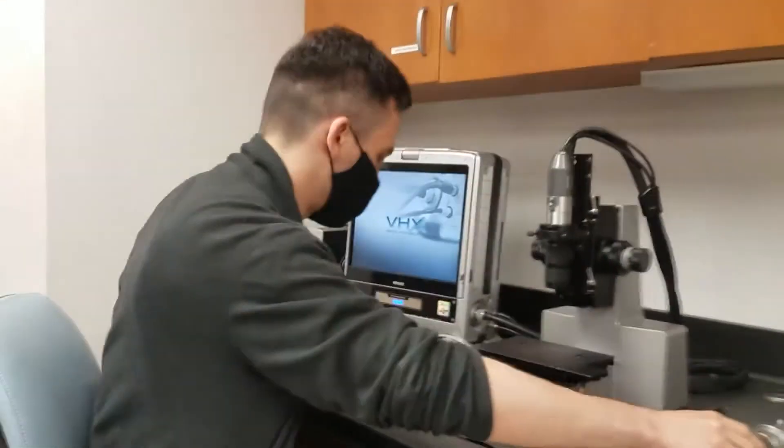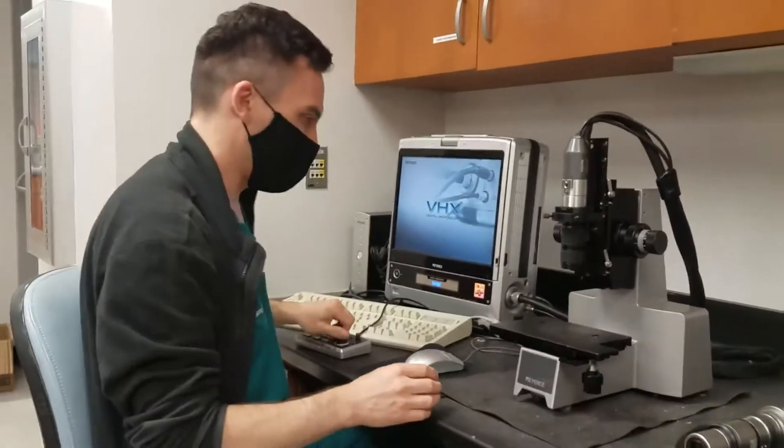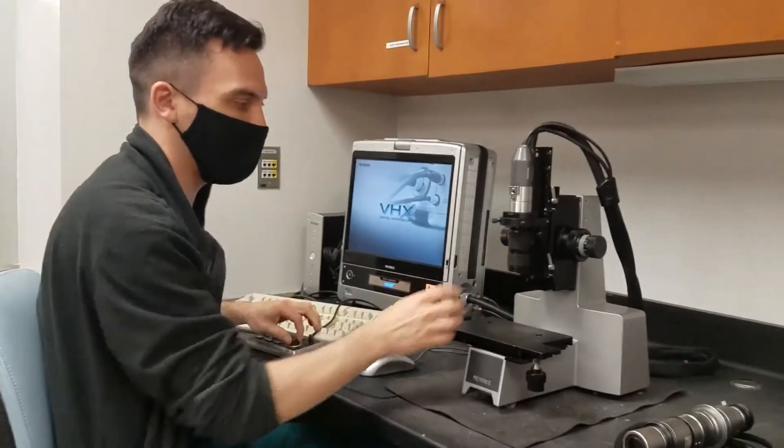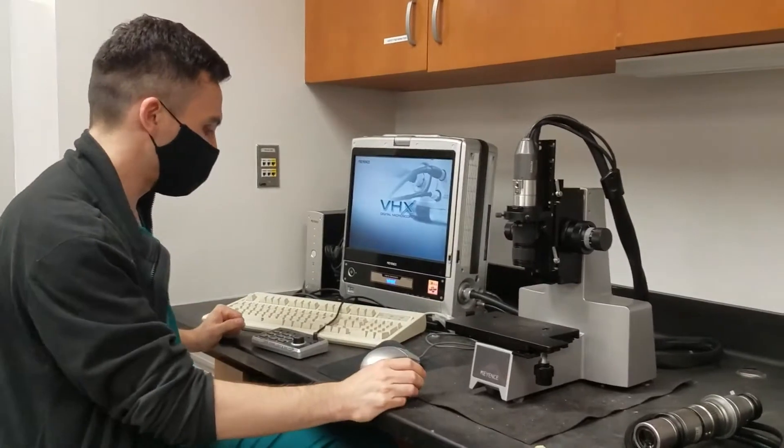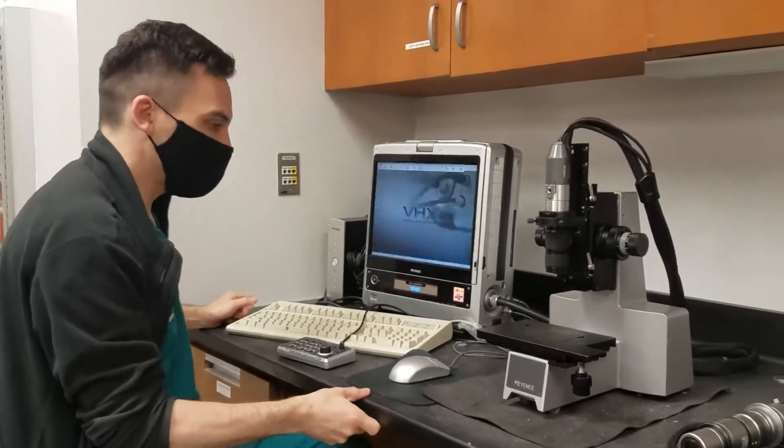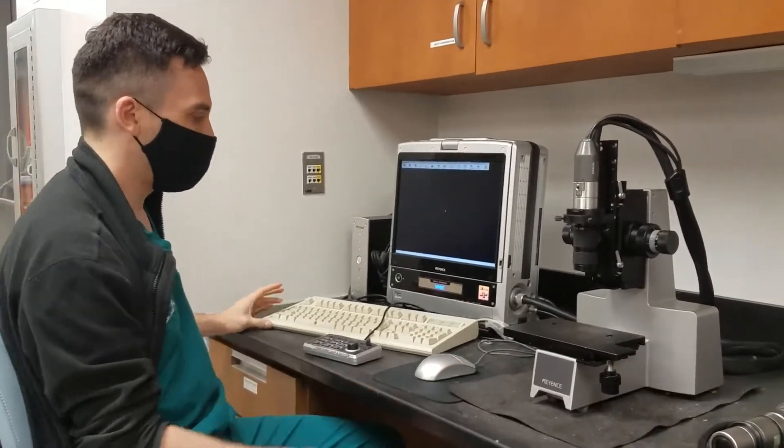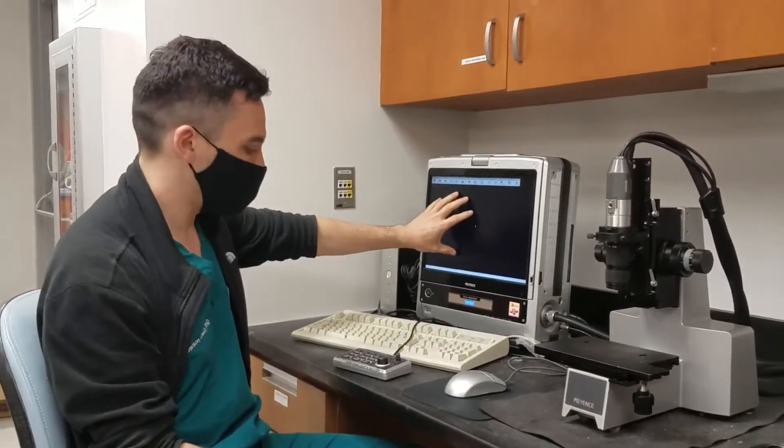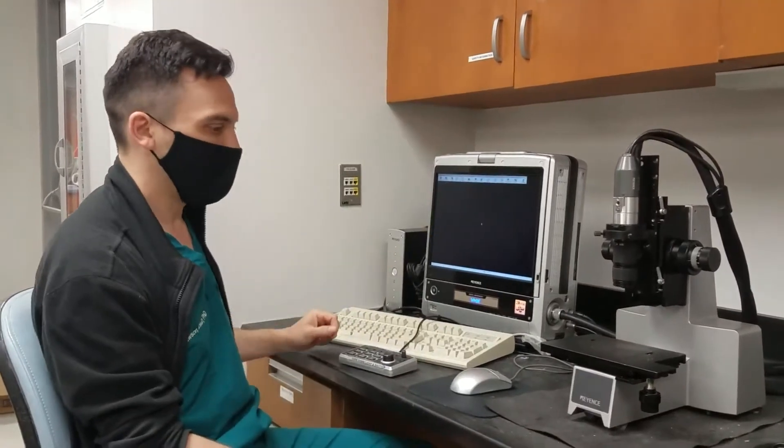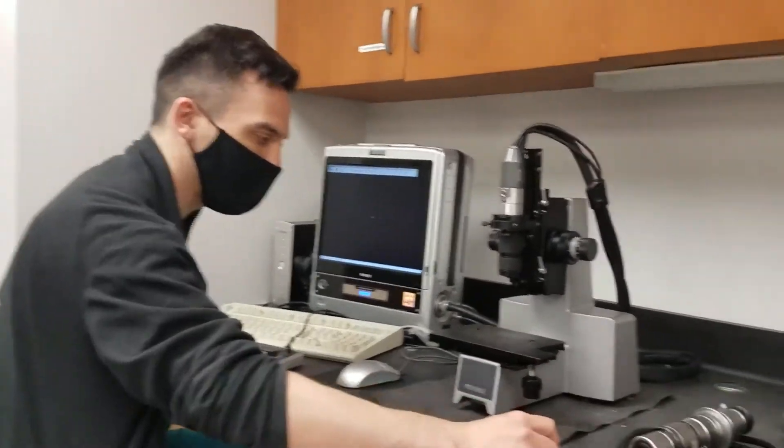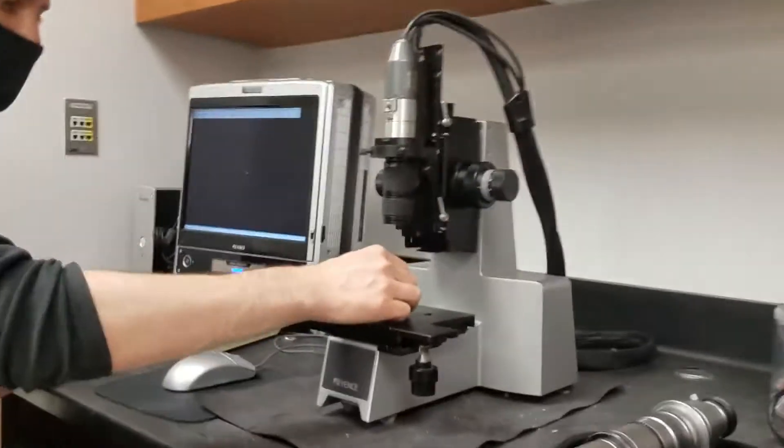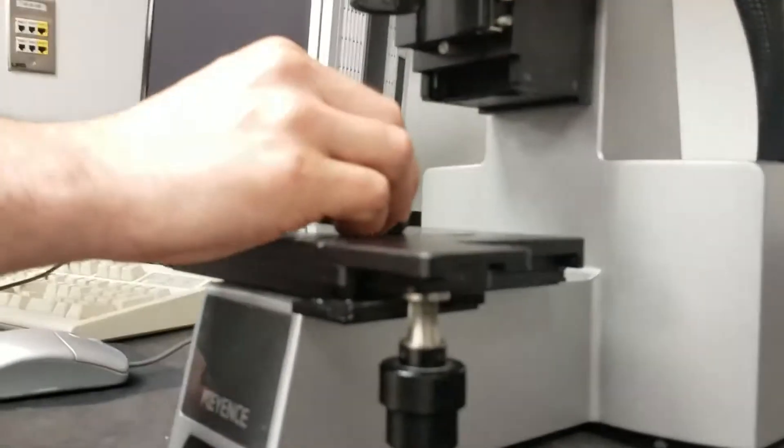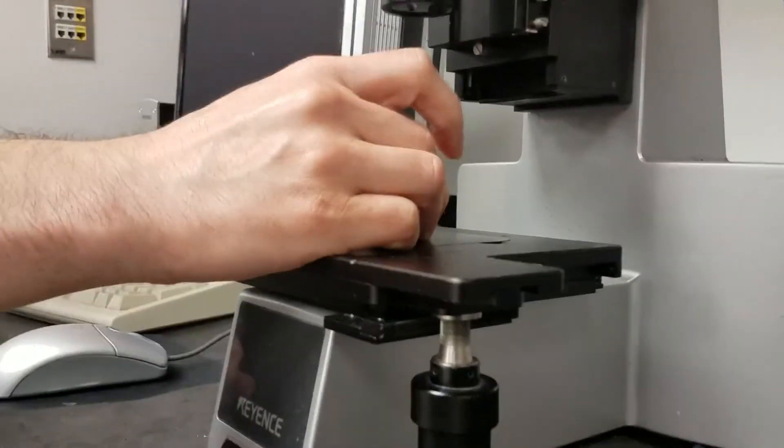So we'll start off with the low magnification. As soon as it gets booted up here, if you want to view an object, you can put it underneath this viewing stage here.